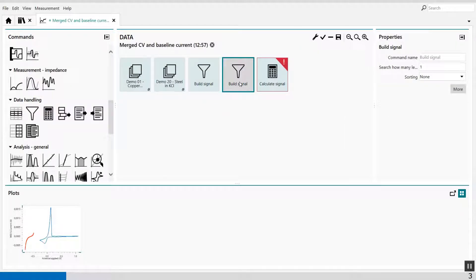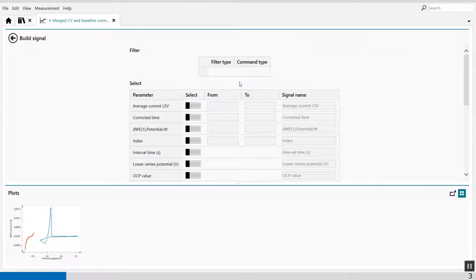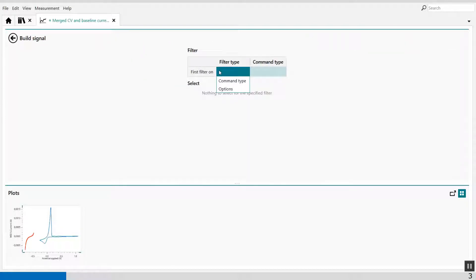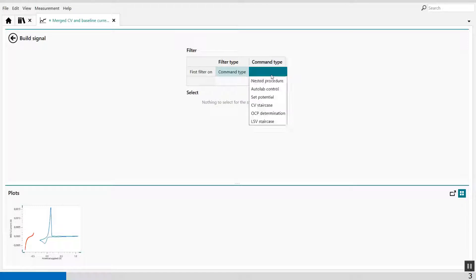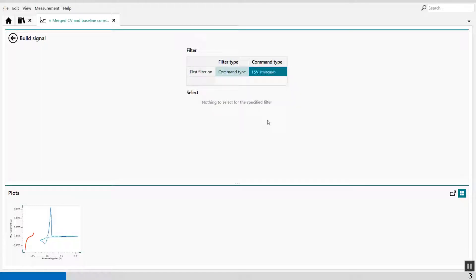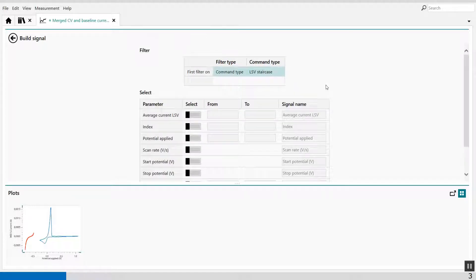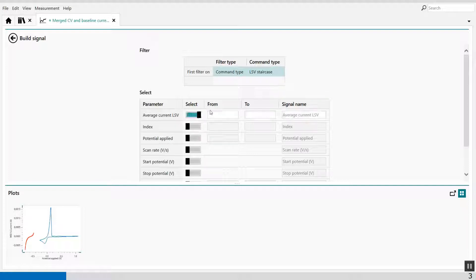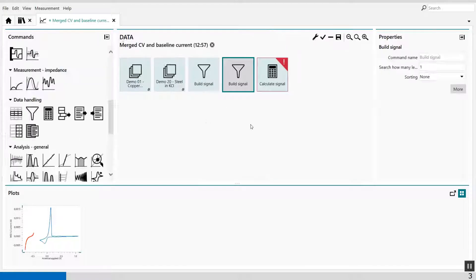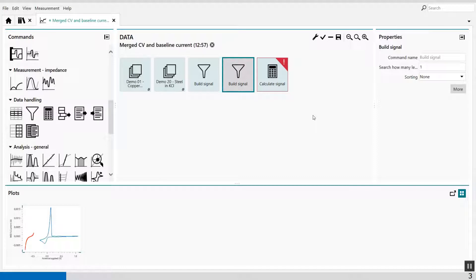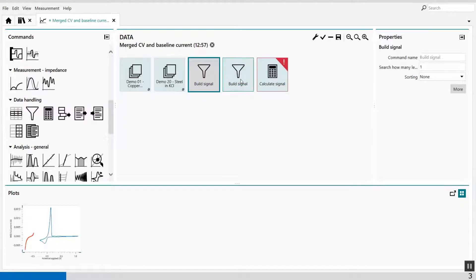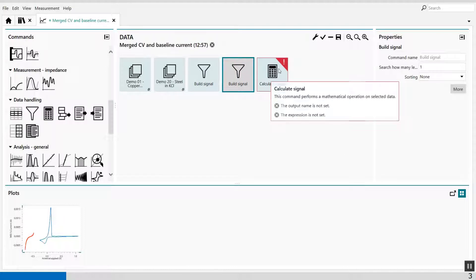From the LSV, I use the second build signal command. I also want to have the average current, which we've calculated. LSV staircase. And from this LSV staircase, we can say average current of the LSV. Like this. Now I can subtract from the CV and LSV the currents.